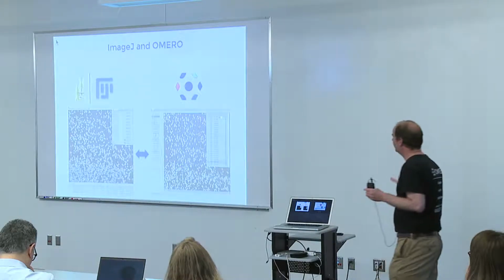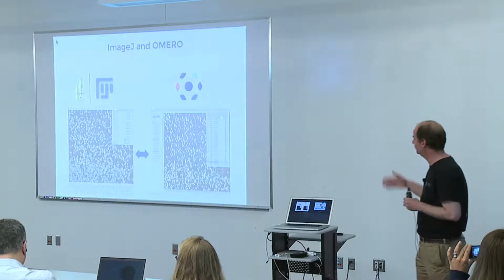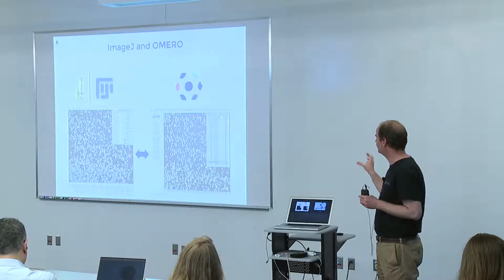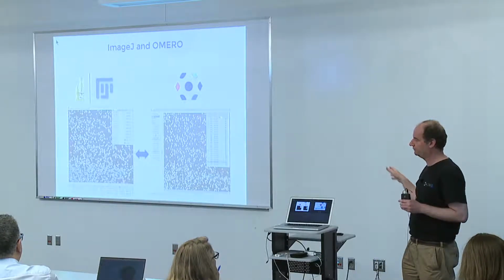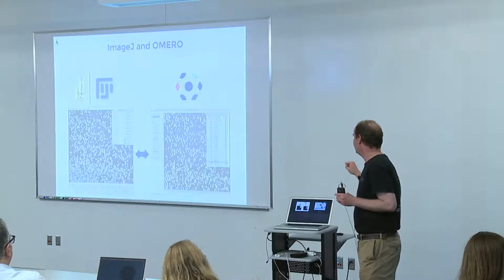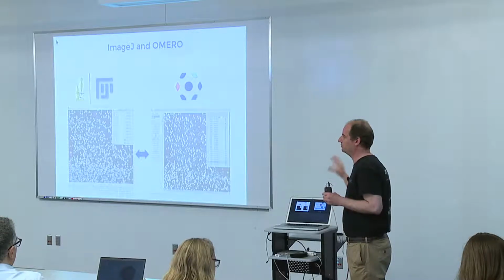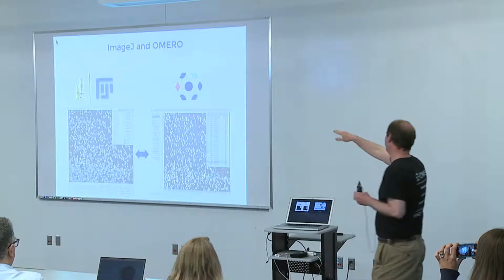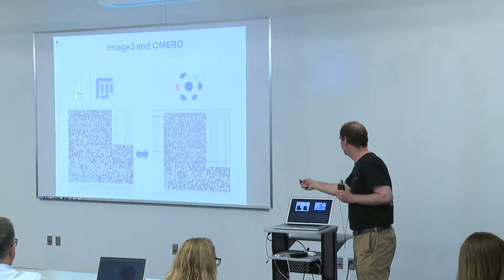The particular features of this data management application you will see in a moment, hopefully, in the workshop. Now, we are at the ImageJ conference, so obviously I will go in the workshop also into what we have as an integration between ImageJ and OMERO. We have an OMERO plugin for ImageJ, where you can basically get all the goodies of OMERO, access to the server using ImageJ as a client. You can, for example, open an image in ImageJ, just like here on the left-hand side.